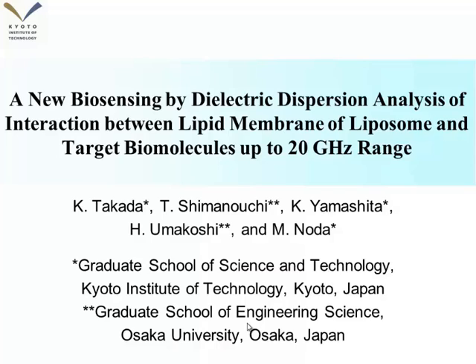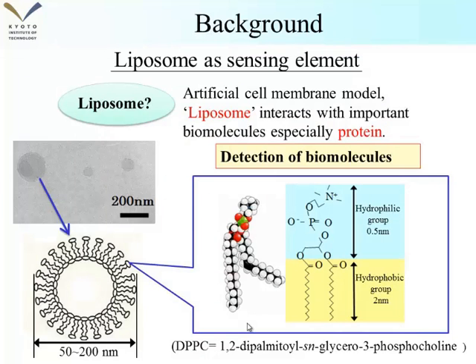Today, I'd like to talk about a new biosensing by dielectric dispersion analysis of interaction between lipid membrane of liposome and target biomolecules up to 20 GHz range. First, I will explain a background. We have used liposome supermolecule as a sensing element.